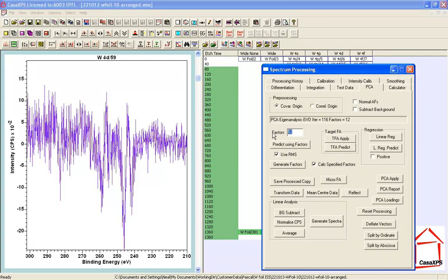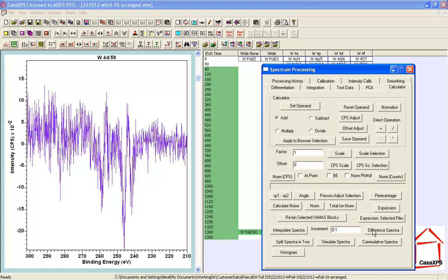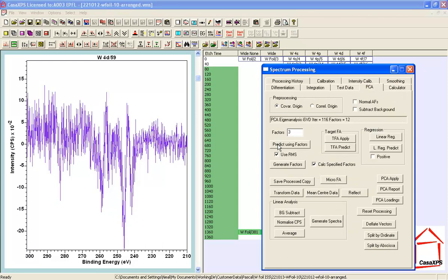The fact that I could identify three abstract factors as having significant shape is useful for two reasons. First, the three abstract factors imply there are three spectroscopic shapes that would represent these data, meaning I ought to be able to calculate three spectral shapes from the data set. Secondly, when we identify three abstract factors we assume all other abstract factors are representative of noise. Therefore if I fit these three abstract factors to the data, the resulting curves will be a smooth form of the data — important because difference spectra calculations will amplify noise.